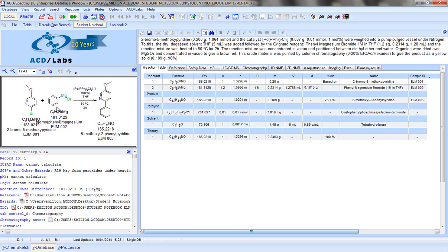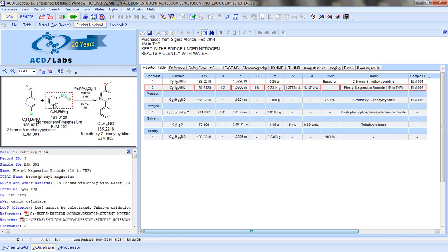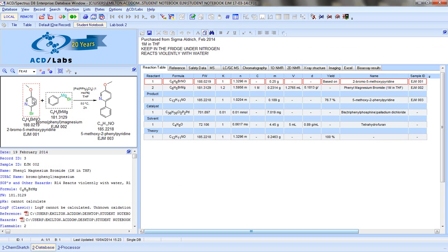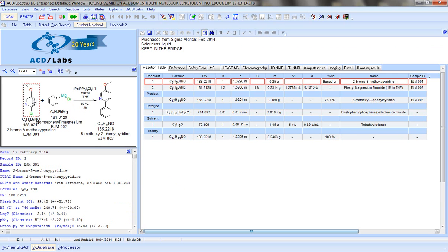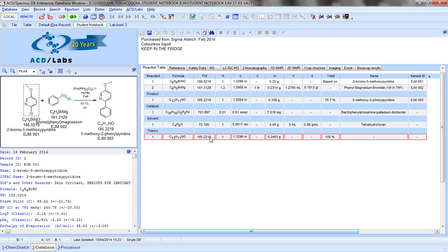If we click on the components of the reaction, we can add notes in this box. Within the reaction table, we can quickly and easily calculate the amounts of reagents involved, the percentage yields of the reaction, and any catalysts and solvents involved.